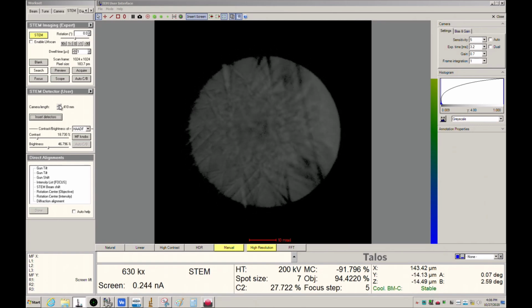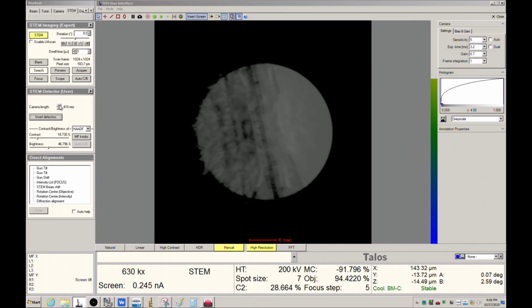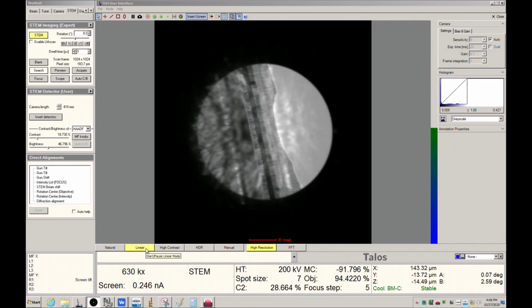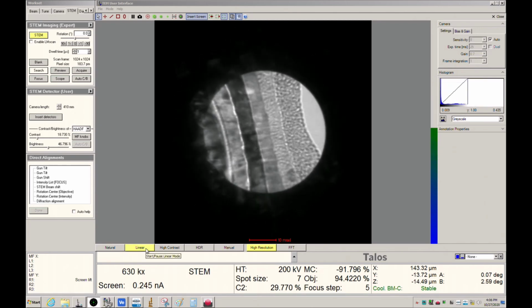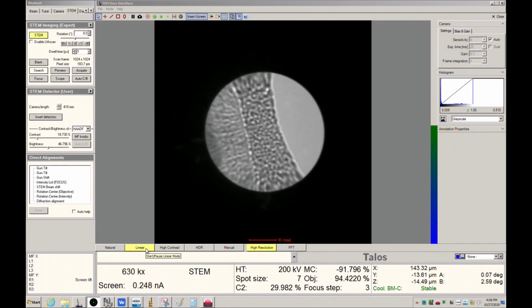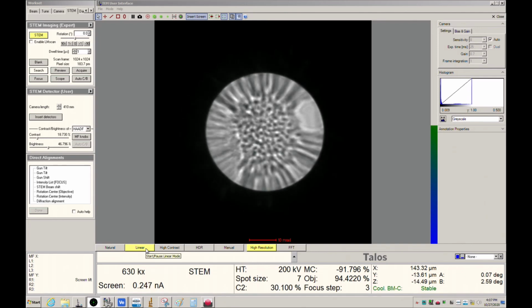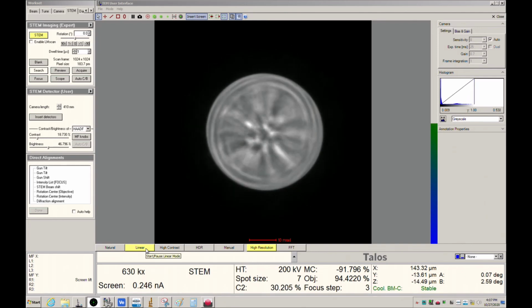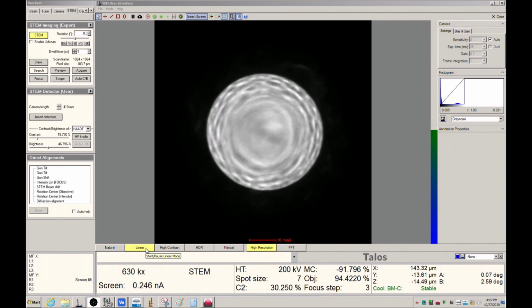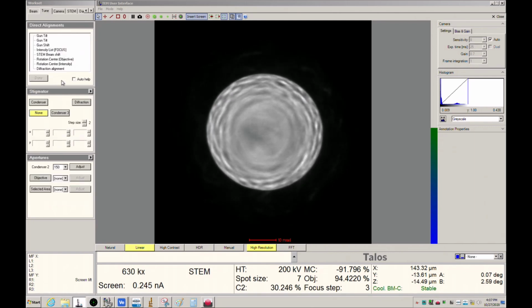And obviously you want to do this over something that is mostly amorphous. I've got some e-beam deposited platinum from our dual beam instrument, which is that stuff right there. And that works great for doing this. So you can adjust your focus till you start to see rings. Perfect. All right. So right here, this is what you want to start from.